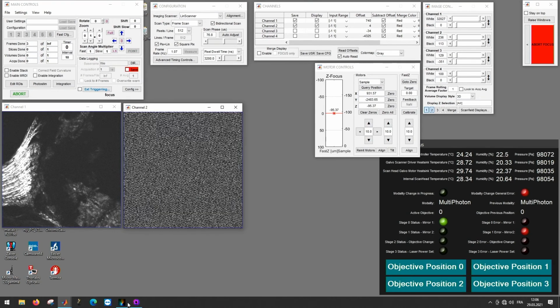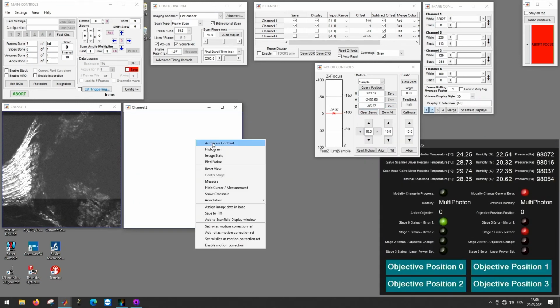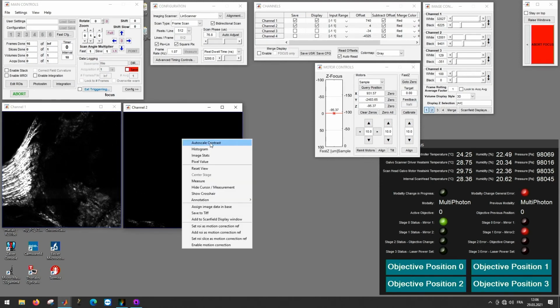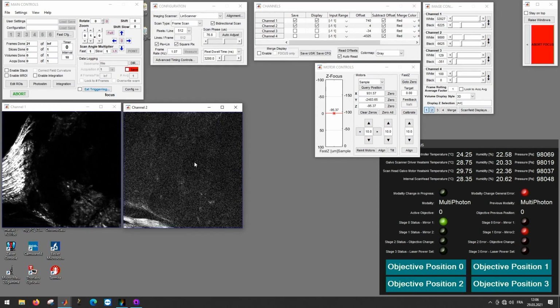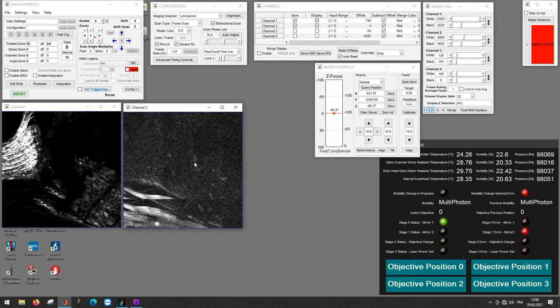and we're already here. We have to reset our PMT in the second channel, and as I told you before, in the first channel we can see the SHG signal, which is at 520 nanometers, and in the second channel you can see the two photon image, which is at 595 nanometers in this case.